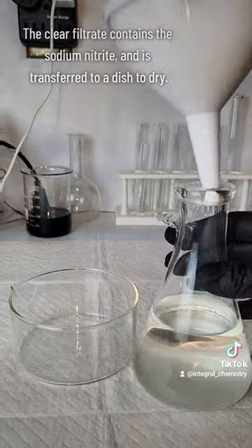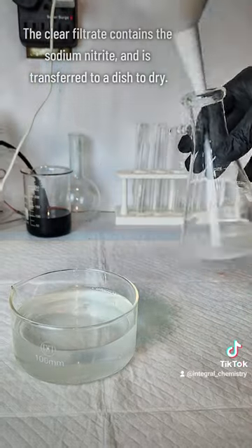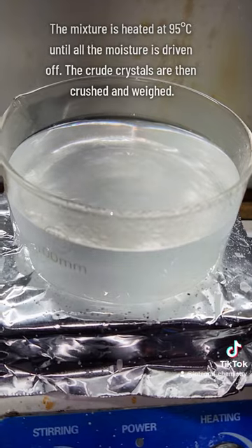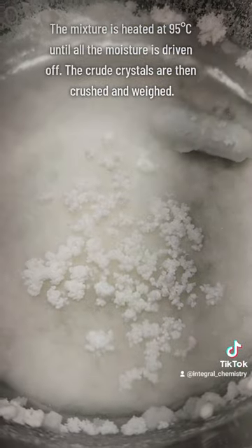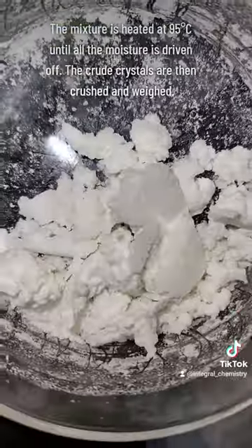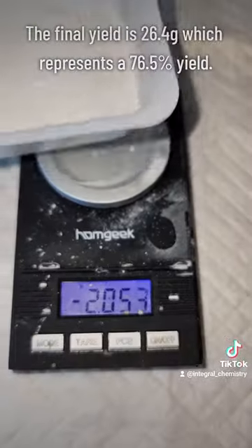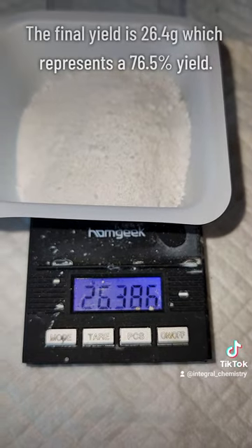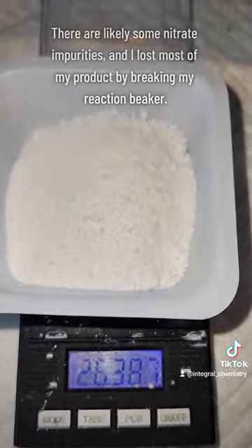The resulting filtrate containing my sodium nitrite is transferred to a crystallization dish and put on a hot plate to dry. The coarse crystals produced at the end are then crushed down in a mortar and pestle and weighed, and I determined that I have a final mass of 26.4 grams of mostly pure sodium nitrite. This represents a 76.5% yield, but that goes under the assumption that there is no sodium nitrate here, which is definitely not the case.